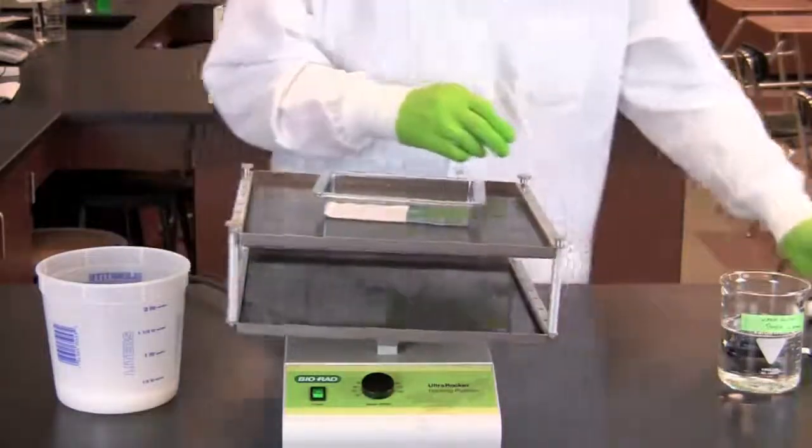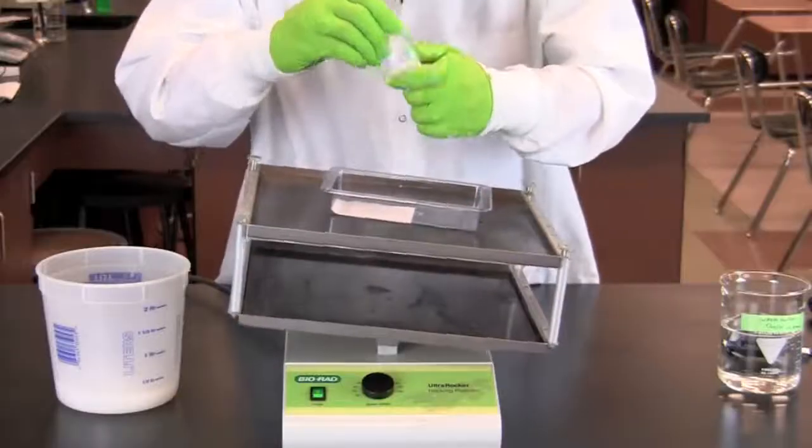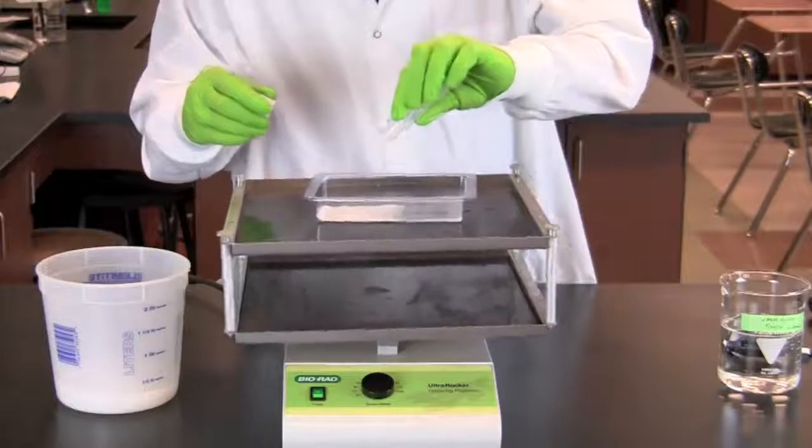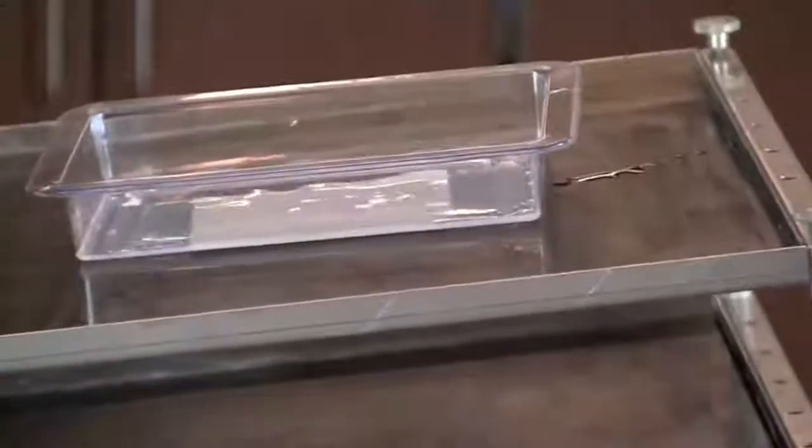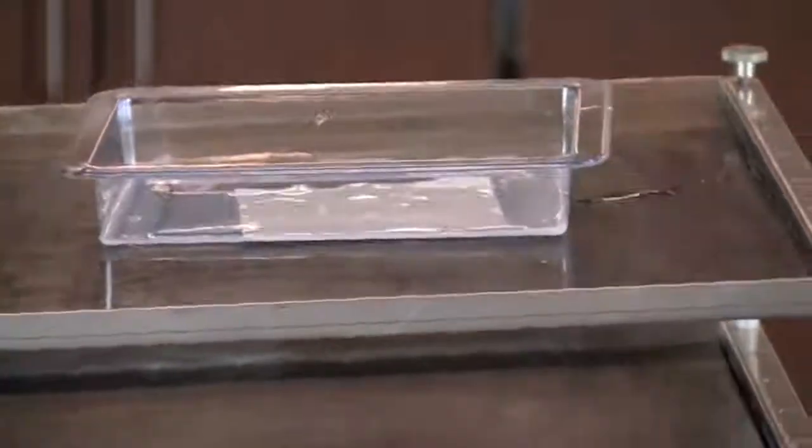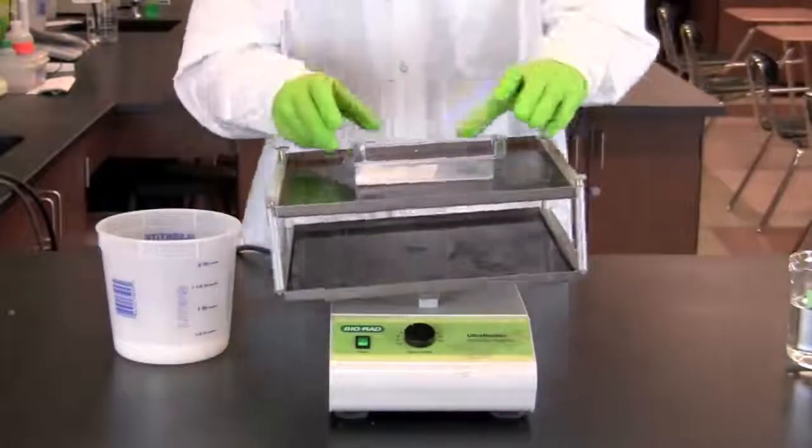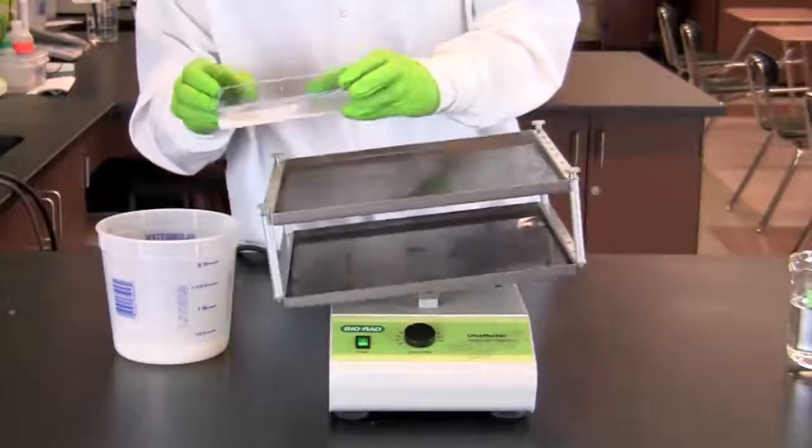Add 10 milliliters of secondary antibody and incubate the membrane for 5 to 15 minutes on the rocking platform at a fast speed. Pour off the secondary antibody.